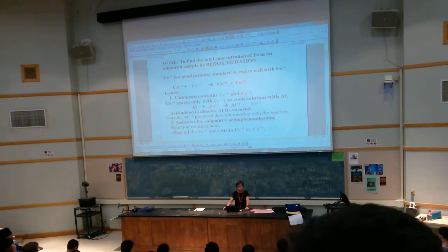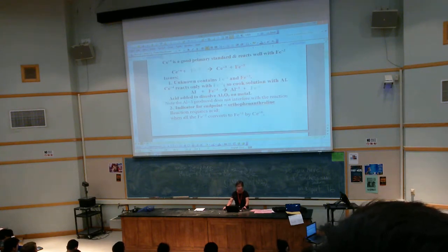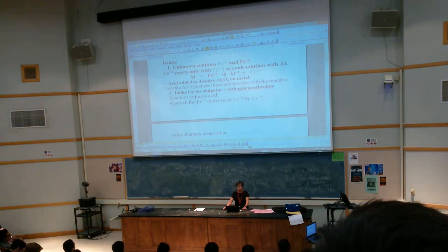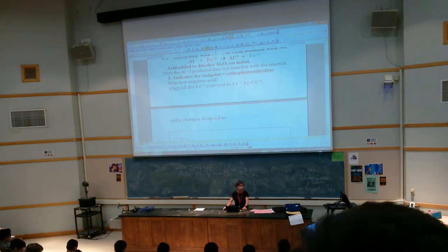If the reaction requires acid, like I said, a lot of these reactions are in acidic medium, so we will put acid in. When all the Fe plus 2 converts to Fe plus 3 by cerium, the color will change from red to a clear light blue color. Okay?